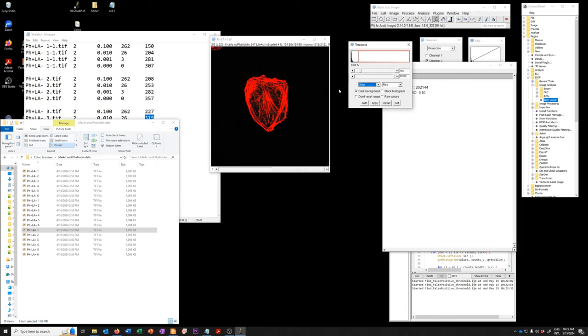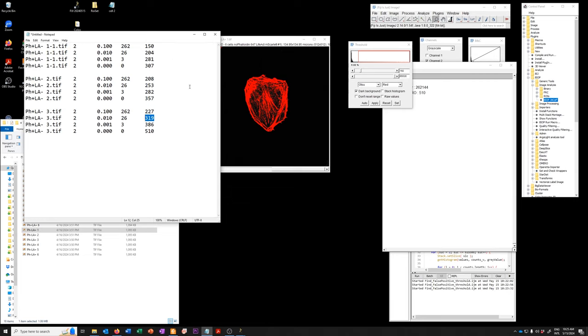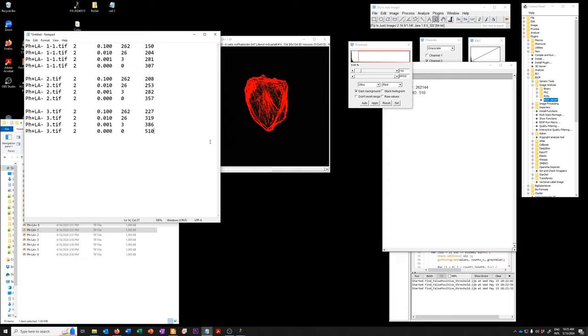So you can see that the advantage of this method is based on an experimental negative control. So it's very well supported conceptually. And it might work for your data set. So it's well worth trying this method out to see if it'll be a good match for what you need to do. Thank you.